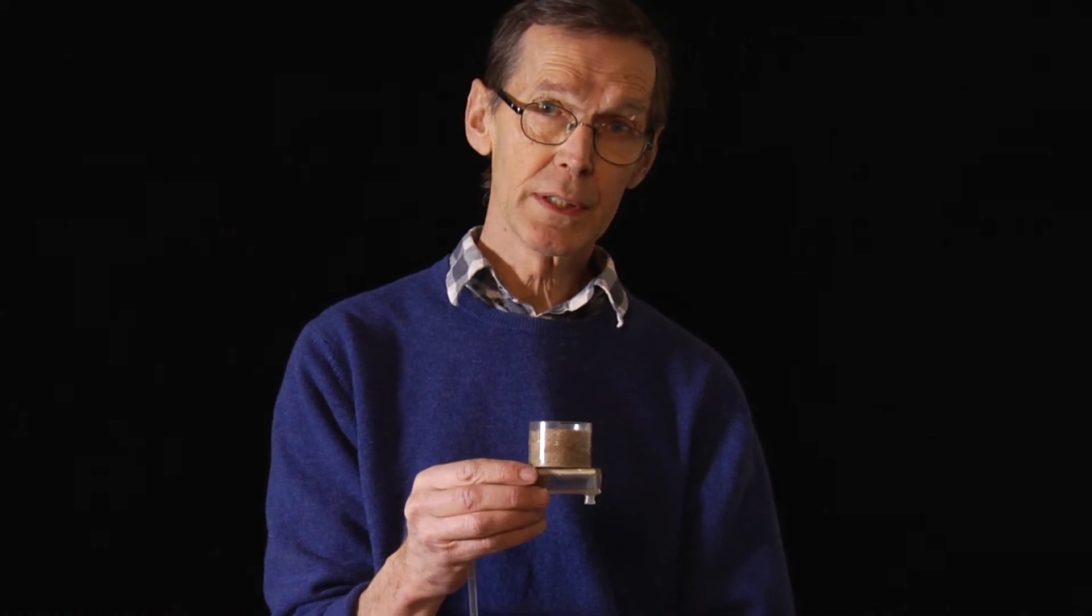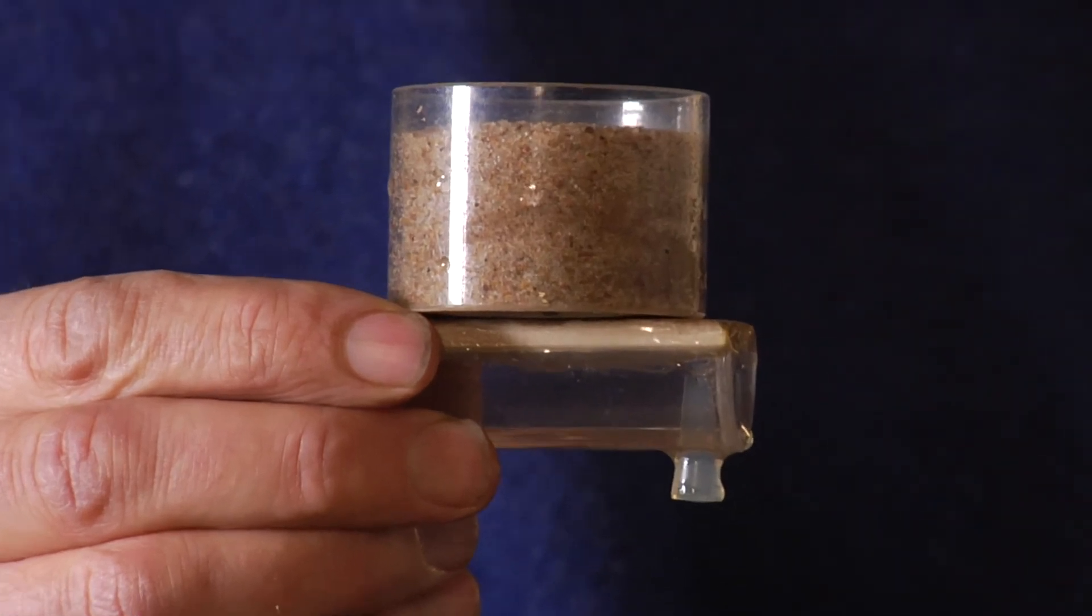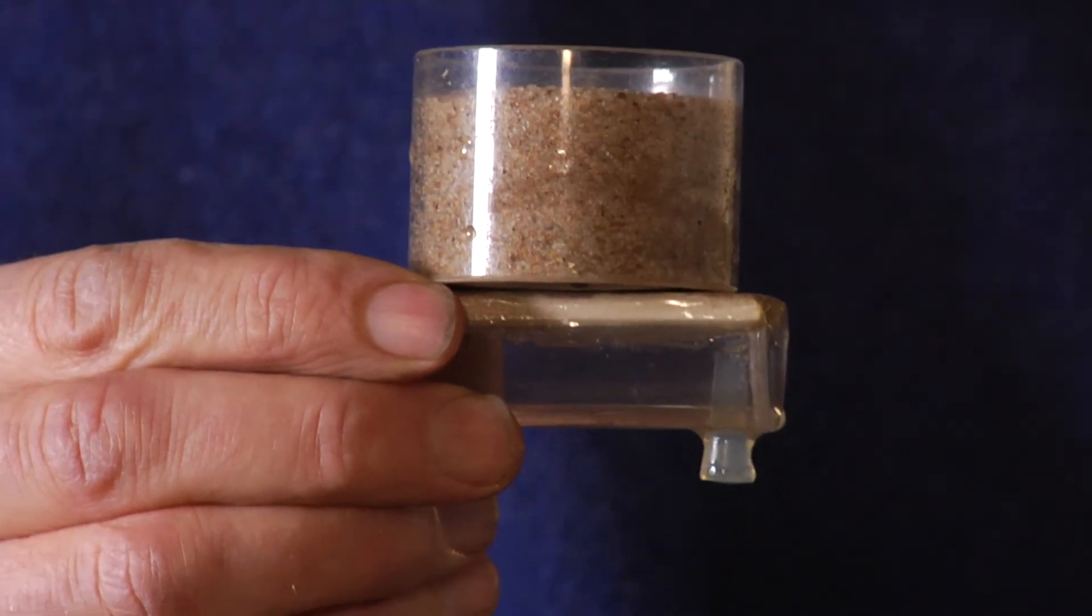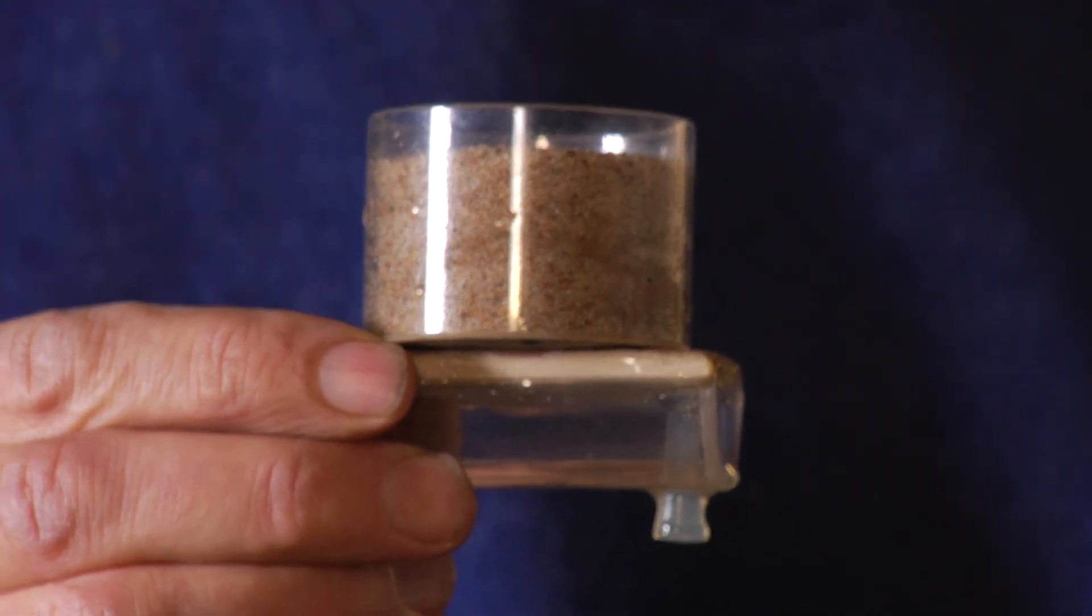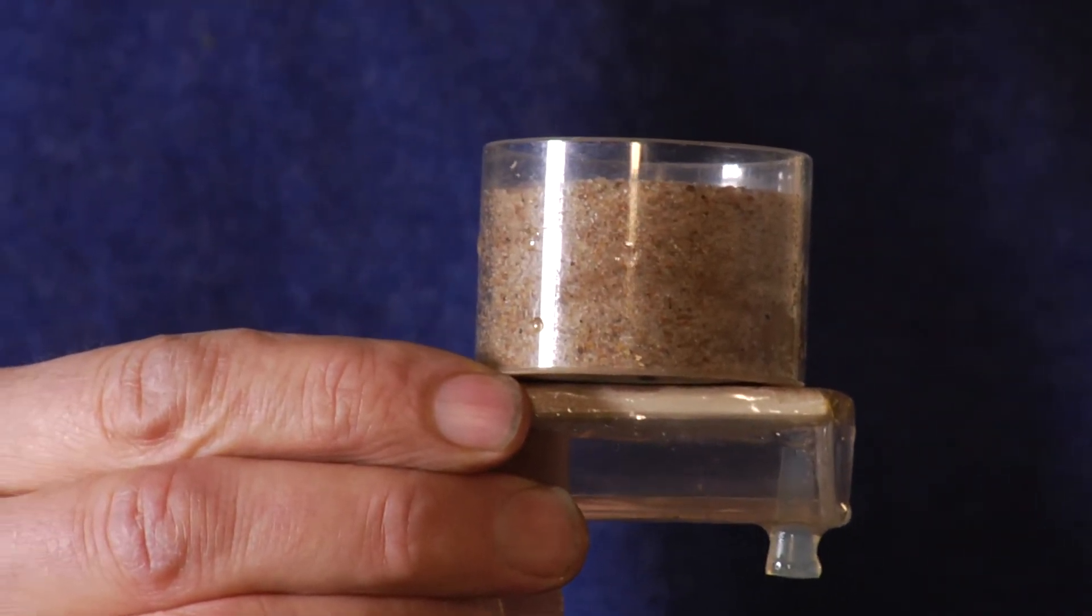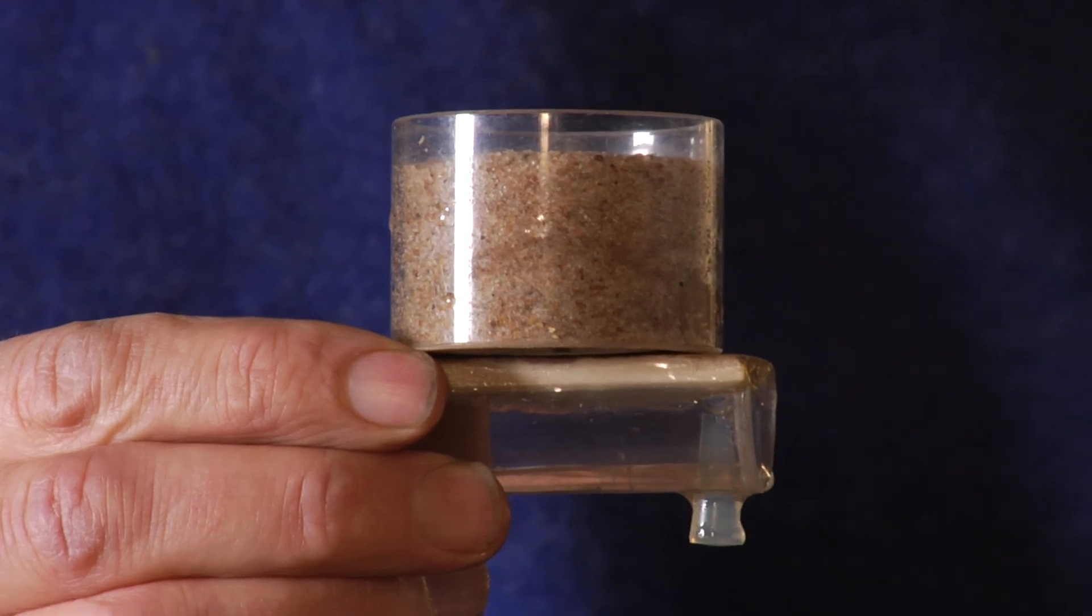Those pores of the plate that are outside the sample are blocked by capillary forces, but water in pores below the sample are in contact with the water in the sample and can conduct water, so water can be sucked from the sand.